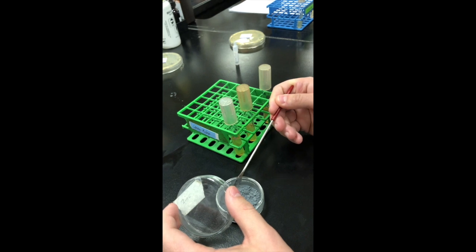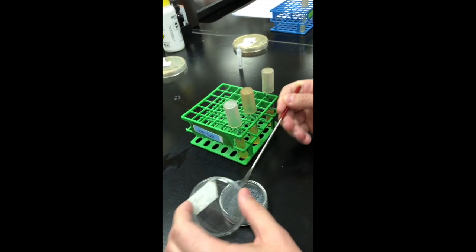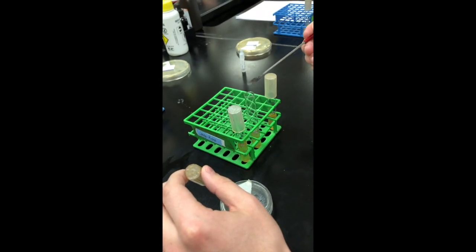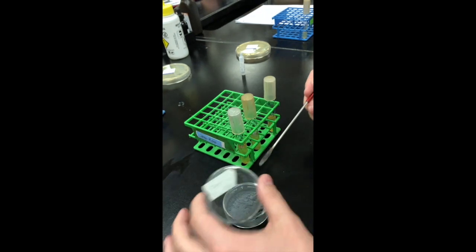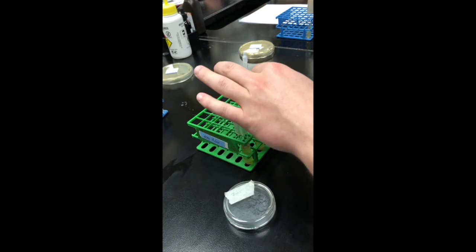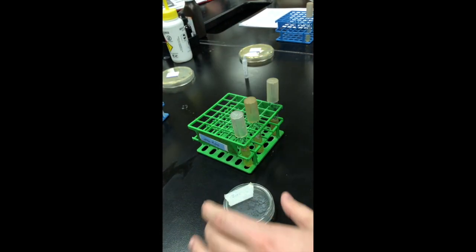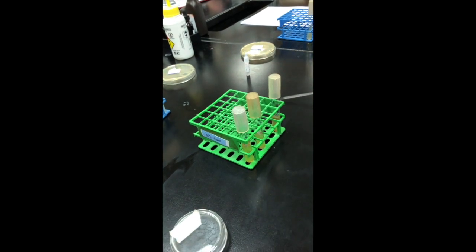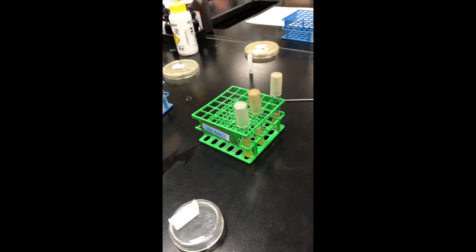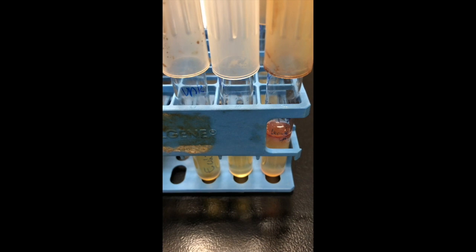If there's no pink color, there wasn't any nitrate left in the tube for us to convert. So we're just going to hang out and wait and see if any of our tubes start turning pink.